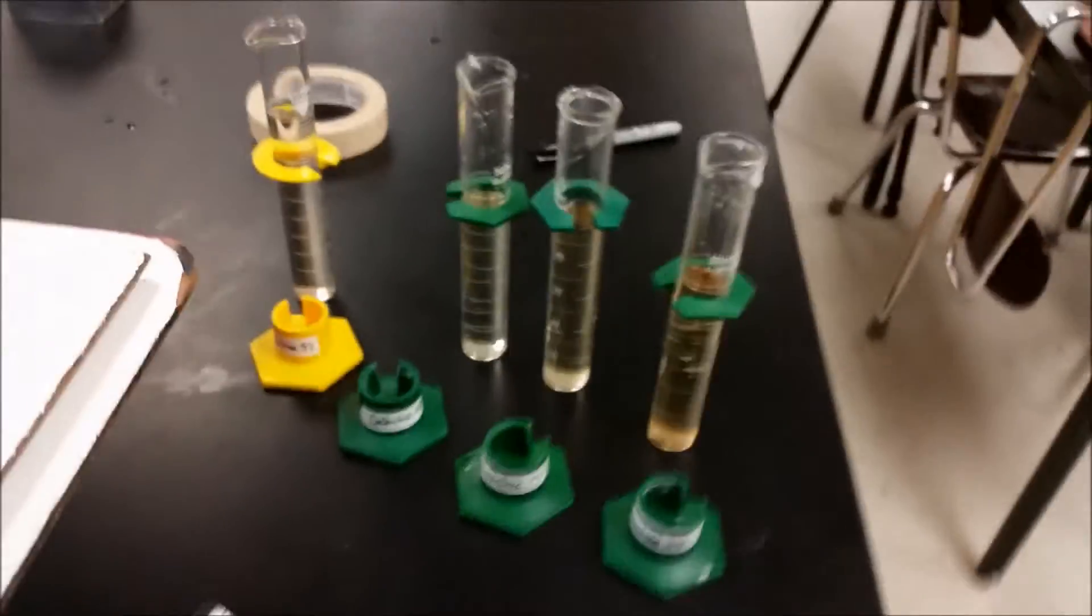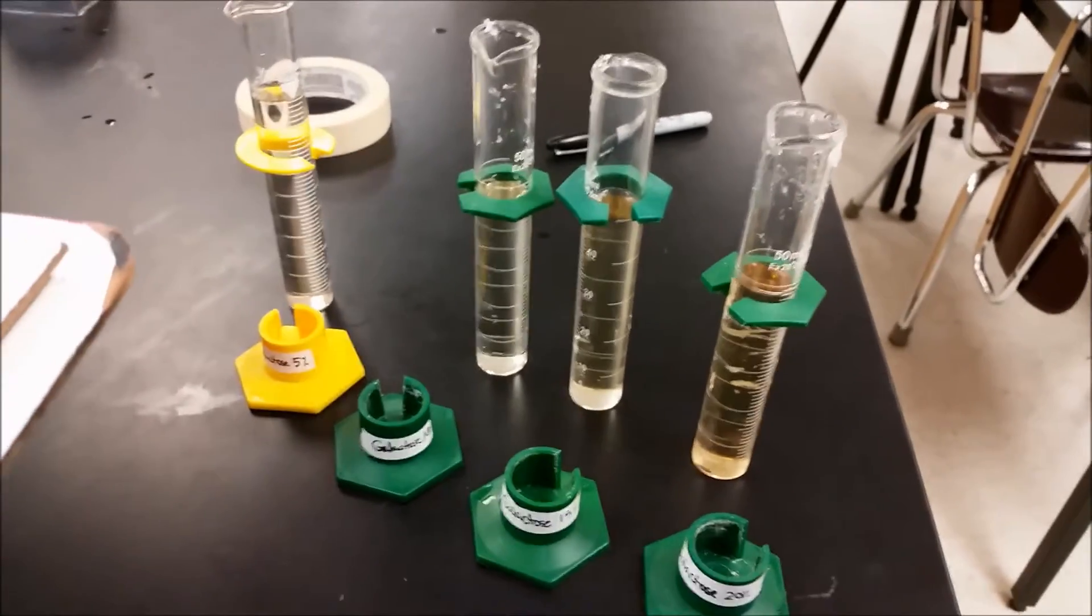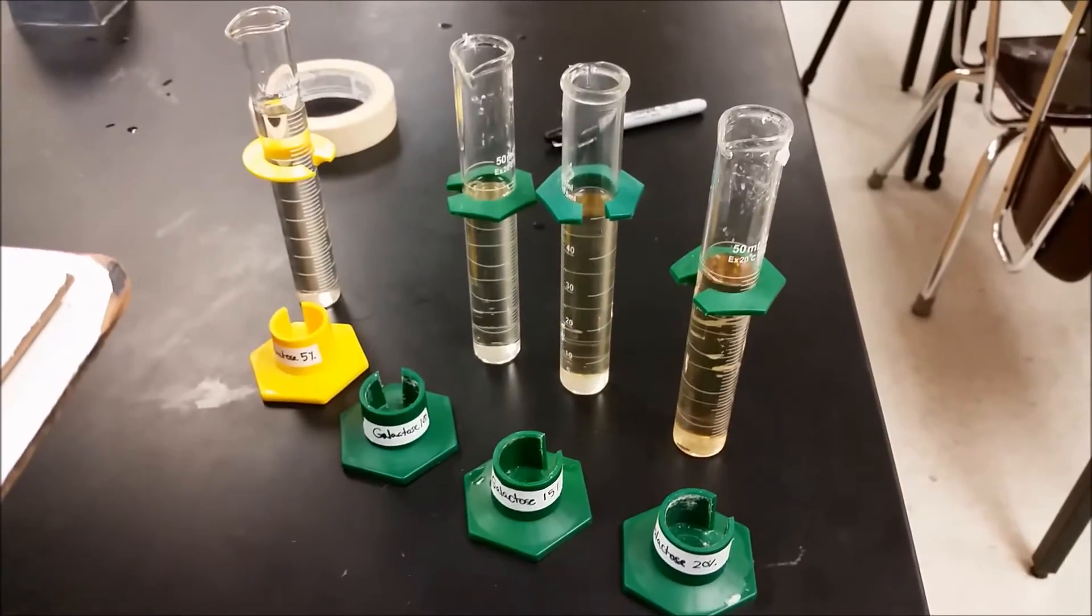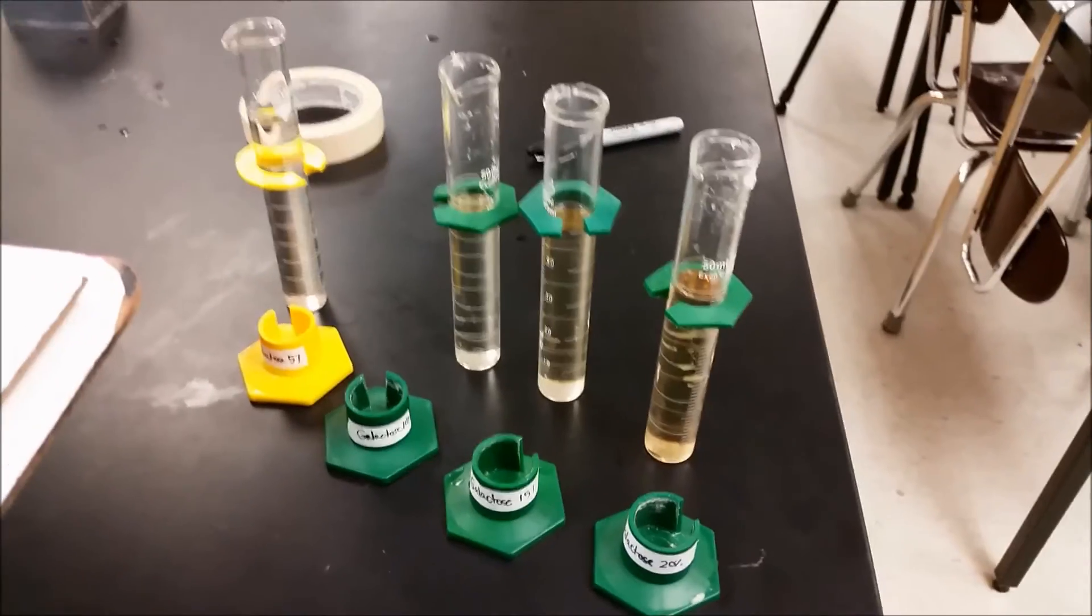And so this is not going to rotate that angle by as much. And in fact, we would expect that as we move from here to here to here to here, as long as these heights are consistent, that the amount of rotation would change linearly by looking at the angle versus the amount of chemical pass-through.